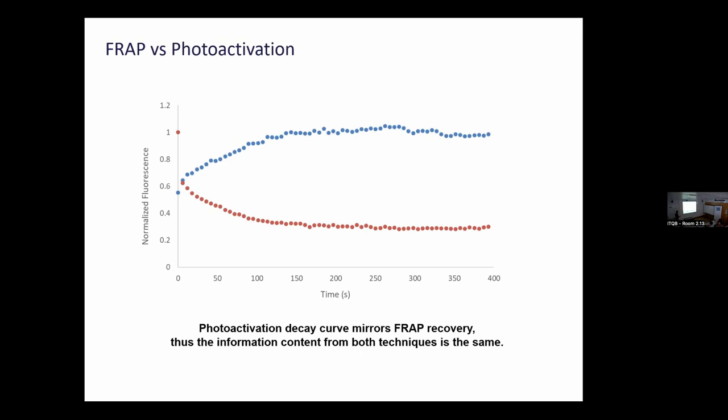In fact, I think that FRAP is still superior to photoactivation because with FRAP, you photobleach, you look at the recovery, you might have some photobleaching that you can compensate. With photoactivation, things are not always as clean as we show them in the slides. You can activate with 405 and it becomes activated, but illuminating with the 488 for imaging with traditional light will also photoactivate a few molecules over time, which can also then be photobleached as well. So with FRAP, you have to take care of photobleaching, but with photoactivation, you need to take into account also additional residual photoactivation and bleaching at the same time. So this provides you with a higher signal to noise at the beginning, but then over time, it might be difficult to control it all.